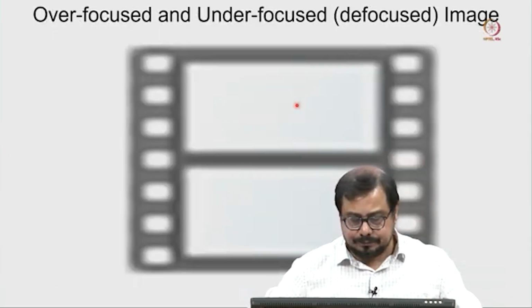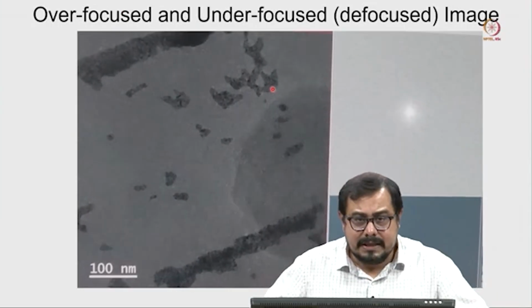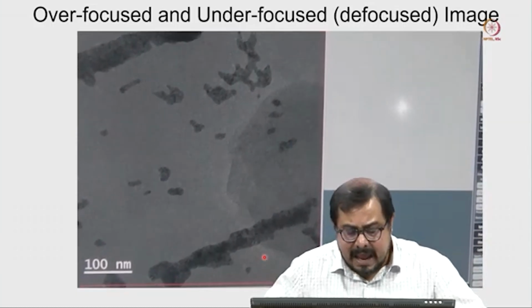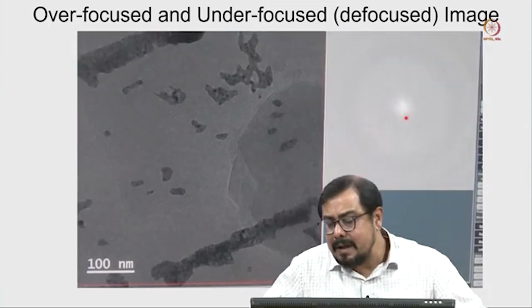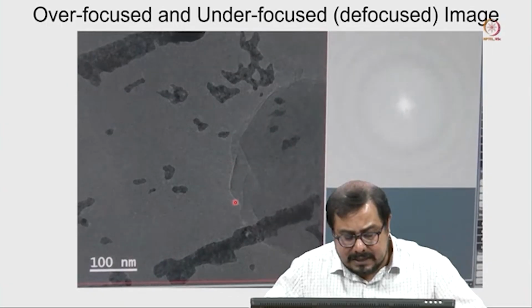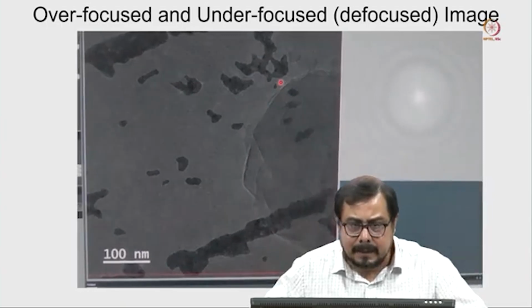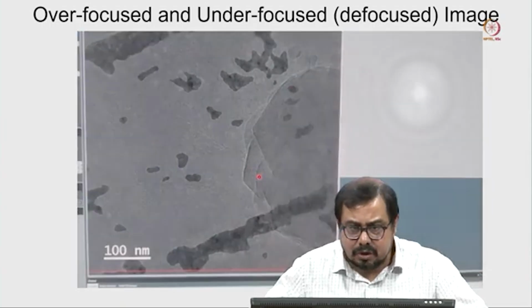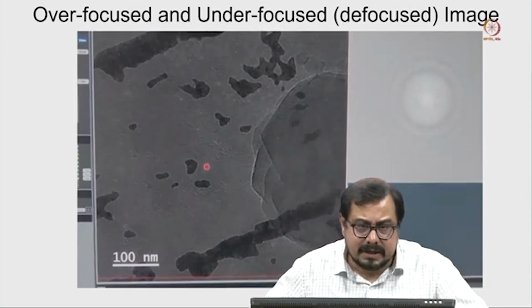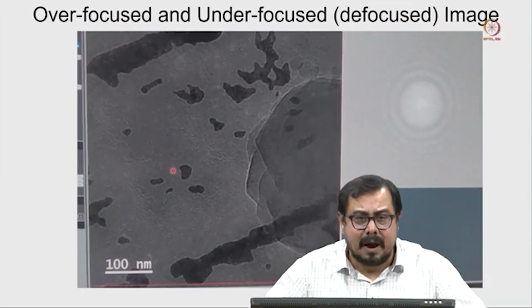Let us take a look. So, here there is an image. In this particular case, pay attention to this one, and this is the power spectrum. This is basically the actual sample. Now, I am gradually increasing the focus, and if you look at this boundary, you can see a white fringe outside this particle, and that is basically helping us to see this particle clearly. Even for those small objects, you can see there is a boundary outside, and in most cases this boundary is a white boundary.